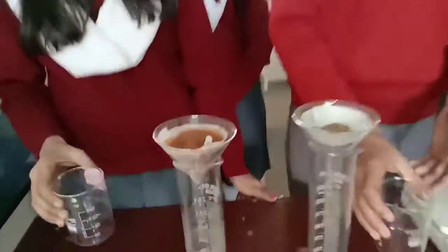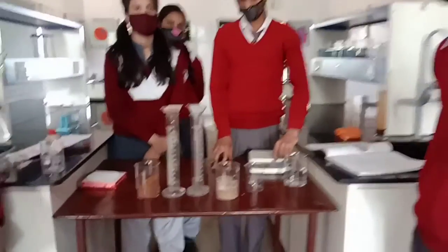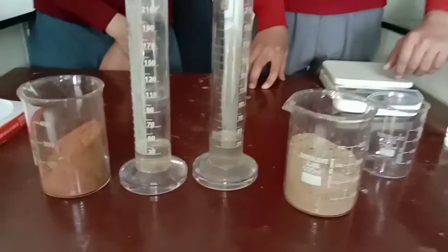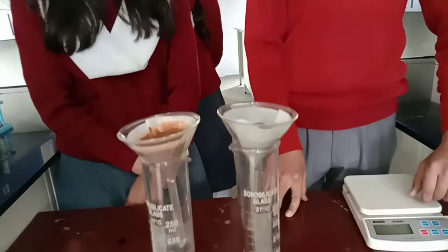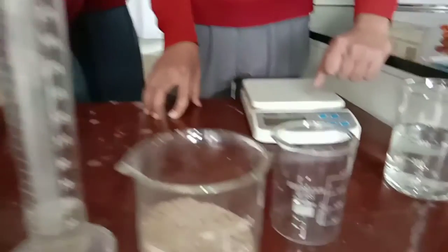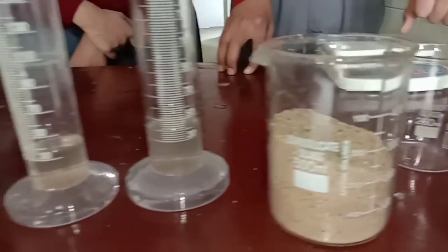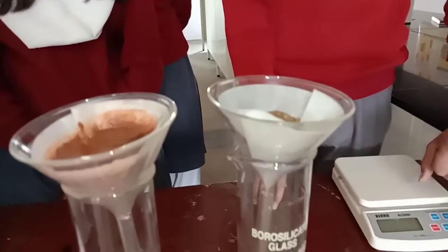Here in our experiment, we find that the filtrate water we get in the case of sandy soil is 40 milliliter. So initially we poured 50 milliliter of water and we have got 40 milliliter of water. So here we can say the retained water in the soil is 10 milliliter. Same for the clay soil also, we can see the percolated water, the filtrate water we get here is 30 milliliter. So the retained water is 50 minus 30, that is 20 milliliter of water.